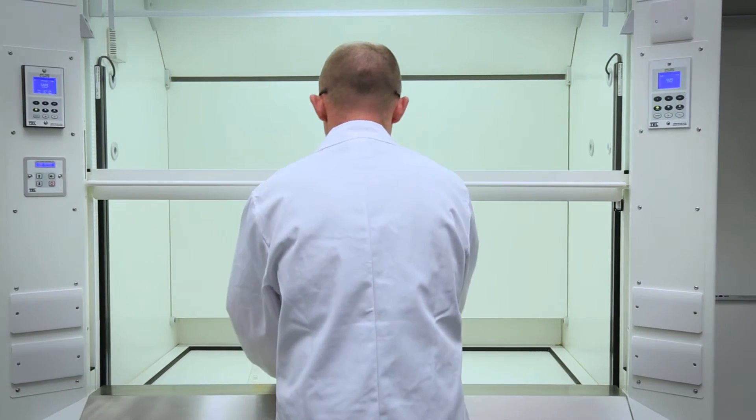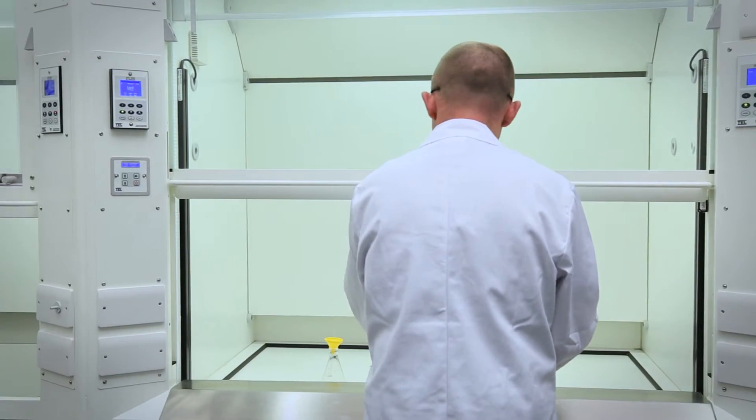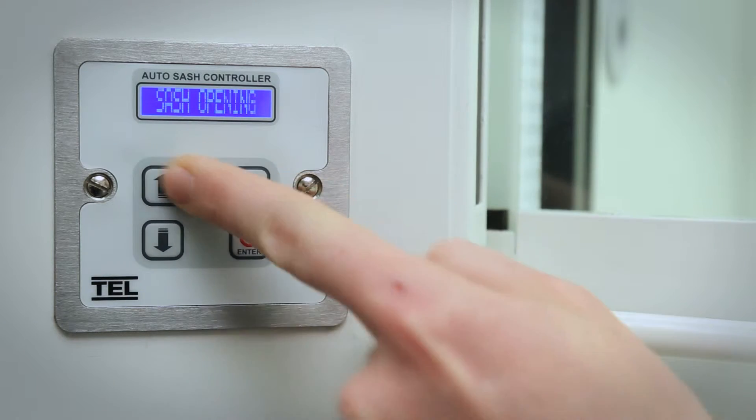During times when the operator is present, the sash can be operated manually via the optional Tiptronic touch sensitive feature or by using the keypad.